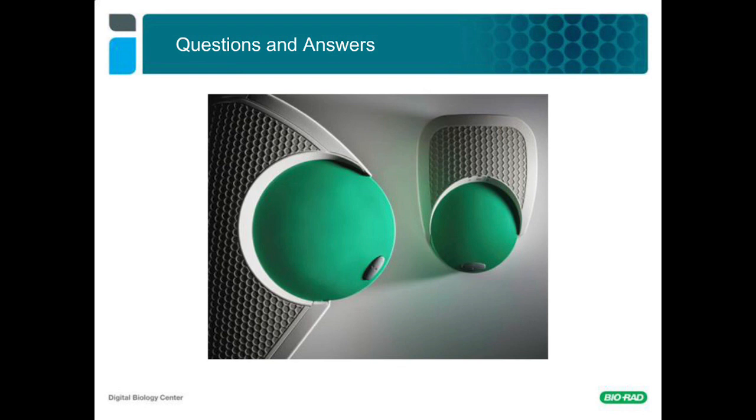So that is a really good question. Absolute quantification can be affected by rain, as we discussed. And so viruses are typically high in secondary structures, so it is especially important to make sure that you're using an enzyme that is allowing you to fully amplify your region that you're interested in. So my recommendation would be to test several different enzymes in order to try to get rid of that rain.